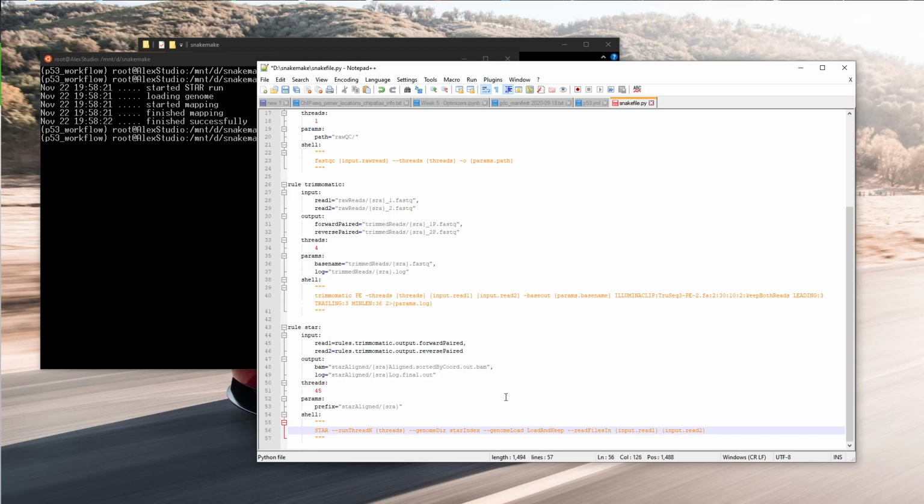Okay. Now we'll do just like last time, out filter intron motifs. Yep, make sure I spelled it right. And then remove non-canonical reads. So you only want the ones that are going to be the typical splicing for RNA sequencing.